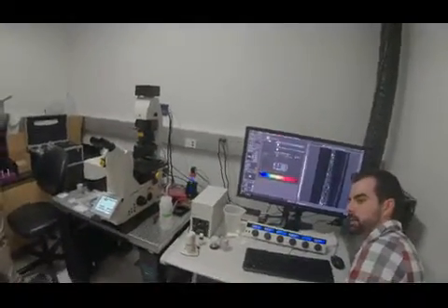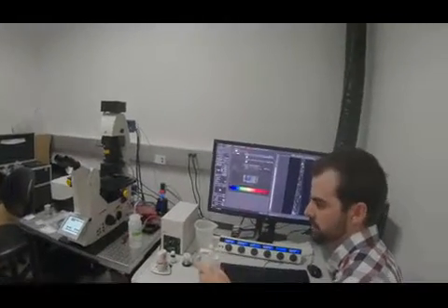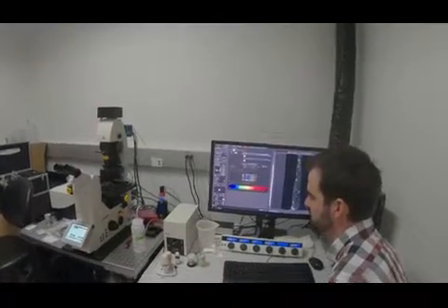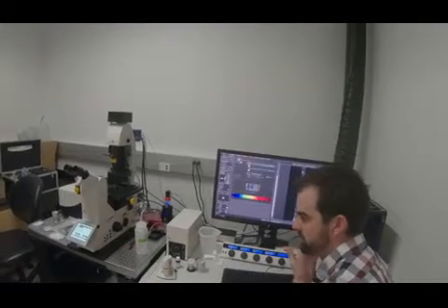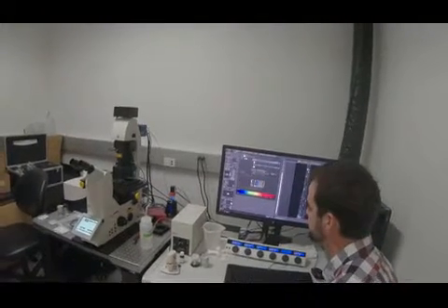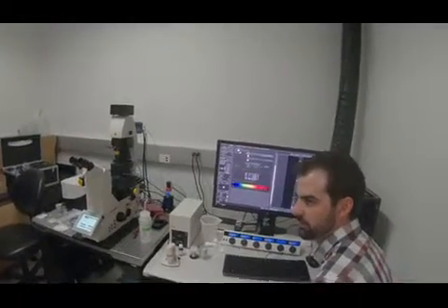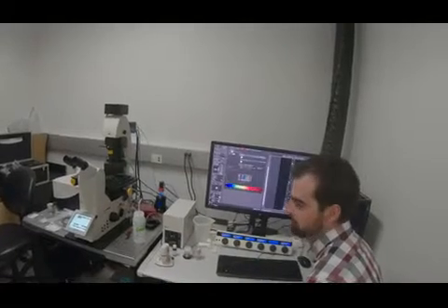Yeah, because the position of the sample will be different in Z than it was in the last dish. But it'll be less work because you'll be relatively close with all those settings as long as you've mounted it in a similar way. And as you get more proficient, the wizard doesn't take much time. But if I'm just here on my own, maybe it takes like 5 minutes to get it set up.